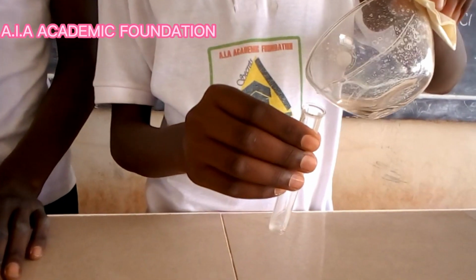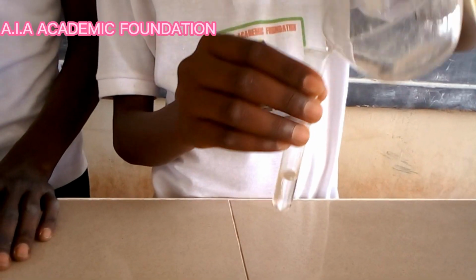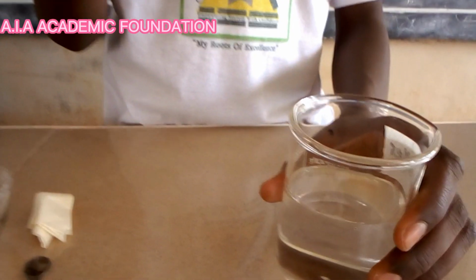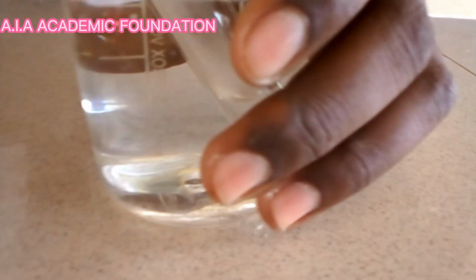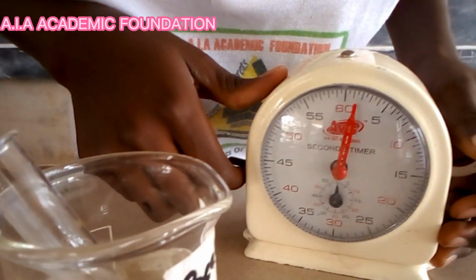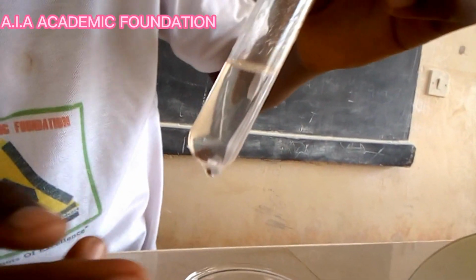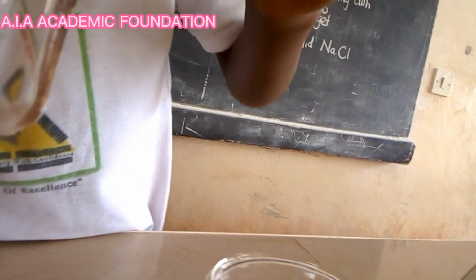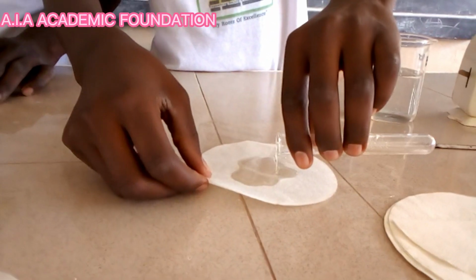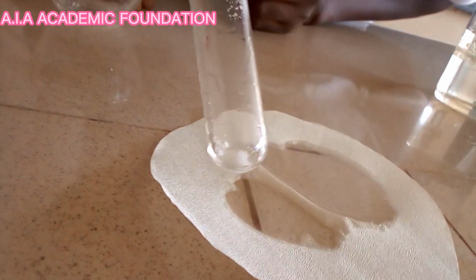After heating, we shall transfer the heated solution into the test tube and put it in the beaker containing cold water so that it can be cooled and we get the crystals. This is a beaker containing water, then I'll put in the test tube so that it can be cooled for 10 minutes. We shall use the stop clock to time 10 minutes. After 10 minutes, you can see the crystals have formed at the bottom of the test tube. So we shall filter the crystals by pouring the water on the filter paper. You can see that the crystals have remained in the test tube.